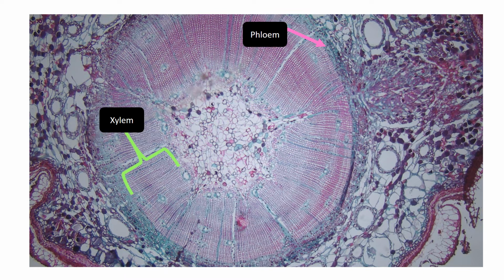And so as it divides, it pushes out more xylem, expanding the width of the specimen. But the phloem will get kind of crushed along the outside, so it's usually a little smaller and flakes off and goes away. So that's kind of what's happening here. Phloem usually not going to be as big of a layer as the xylem, and you can clearly see those two. But what if we get closer? Technology allows us to enhance the image.